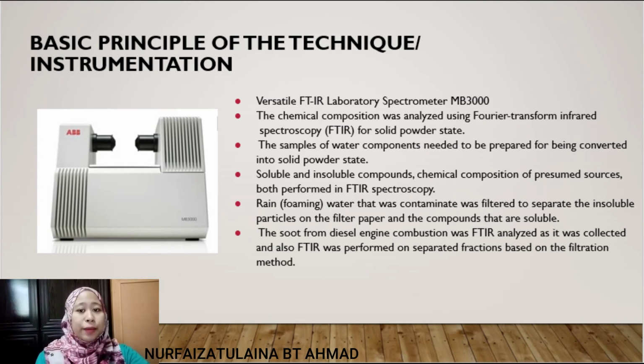Next is the basic principle of the technique using FTIR. The apparatus used is a versatile FTIR laboratory spectrometer, the MB3000. The samples of water components and the soot needed to be prepared by being converted into solid powder.